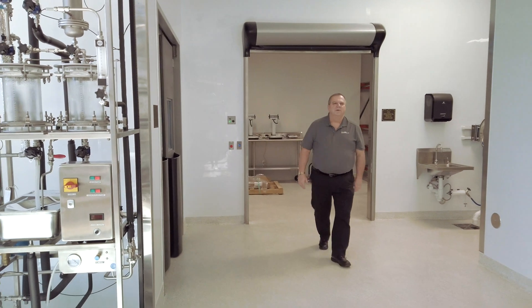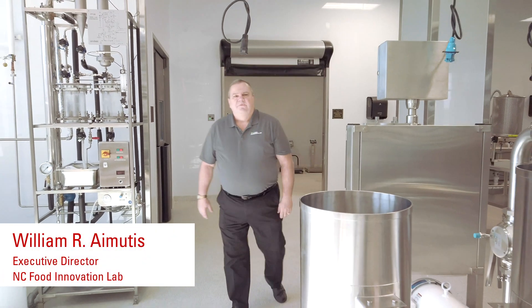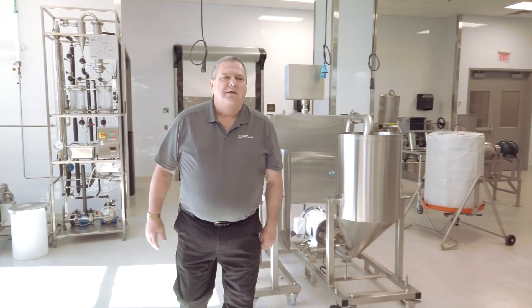We nearly begin all of our processing in the wet processing area of the Food Innovation Lab. Fresh produce comes in, we sort it, blanch it, peel it, utilizing the equipment in this part of the facility.